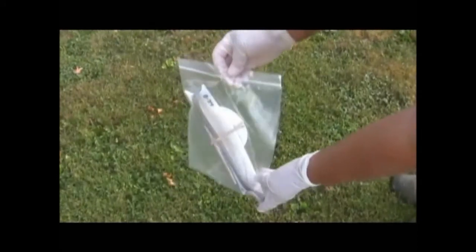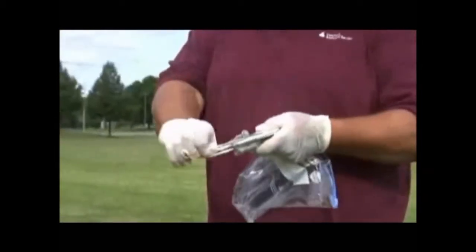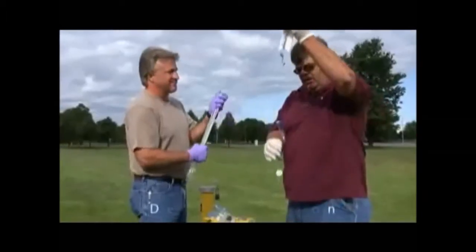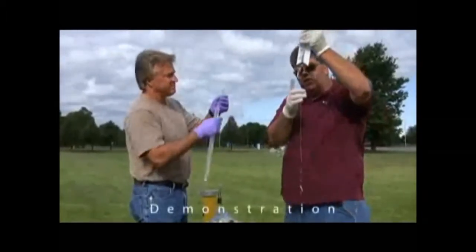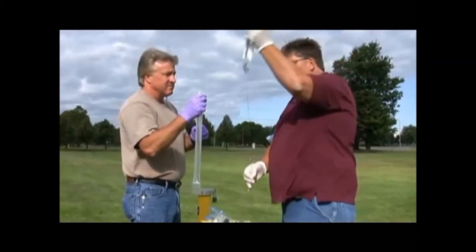When you order a PDB device from ALS Environmental, we will provide a hanging assembly that is labeled and pre-sized to hang at the correct depth of your well screen. This is a standardized PDB, pre-filled with 220 ml of certified ASTM Type 2 DI water.